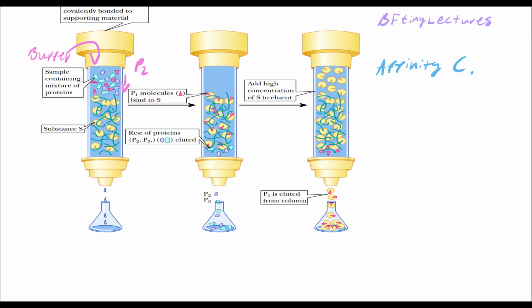And all you're going to get is the protein, okay? So now we have protein 2, which is more purified. So this is protein 2 purified. So that is just pure protein, pure enzymes, no organelles at all. Amazing, okay? So notice that as we keep doing these methods, we get more and more specific.